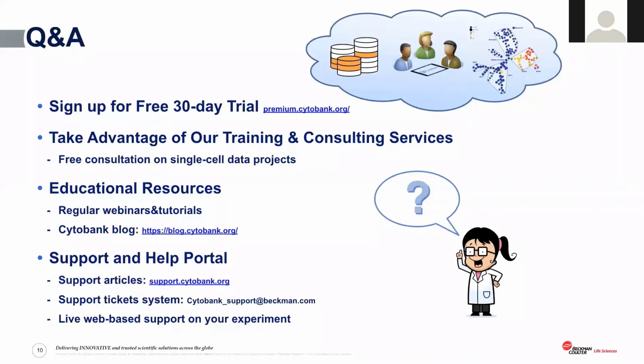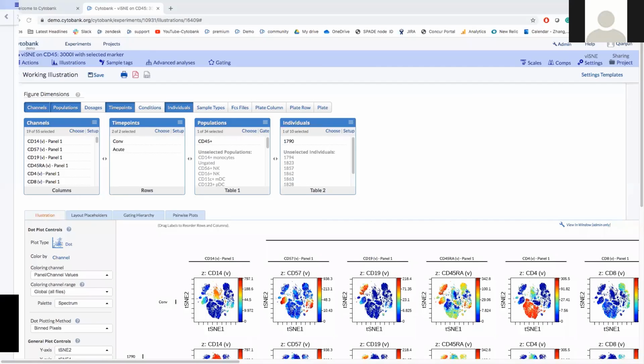Sure, that's a great question. So if the data is not clean, such as you didn't gate out all your dead cells or aggregates, then all those events that don't have really clear biological meaning will be factored into all your downstream analysis. So it's going to give your data a lot more noise and lead to artifacts that are not relevant or meaningful for you. And even worse than that, it could really detract from being able to make interesting and important findings from your data, because it's all kind of distractions from the real clean signals.